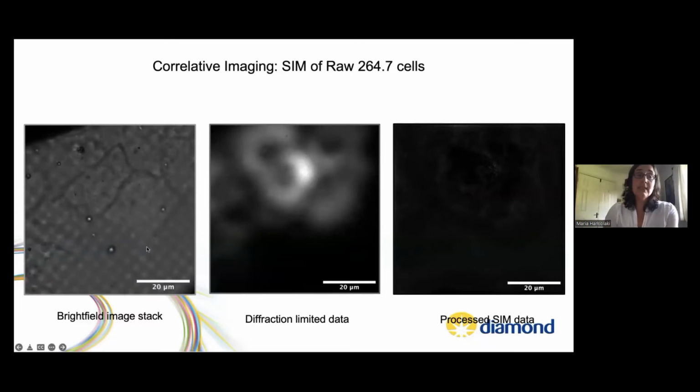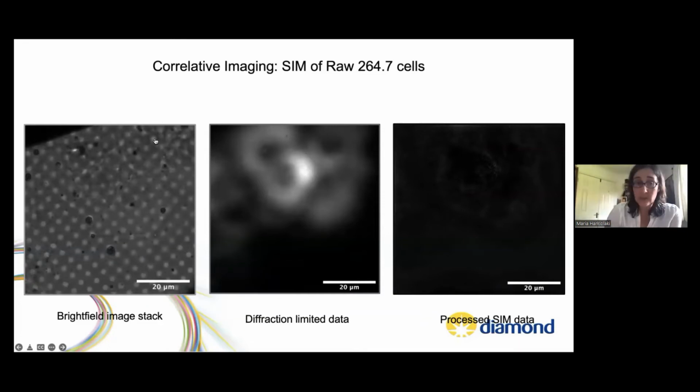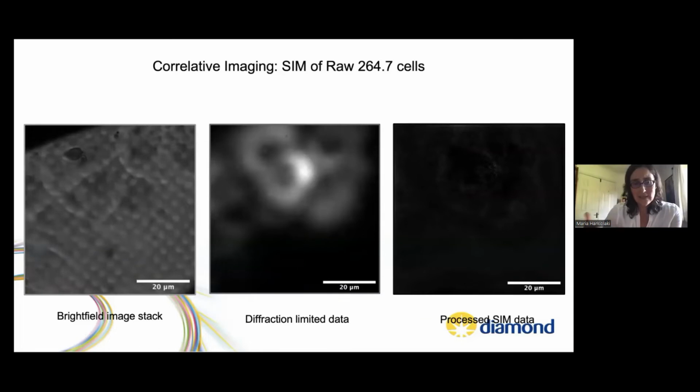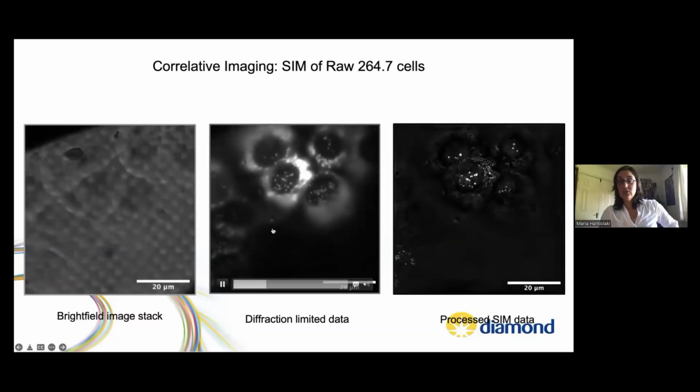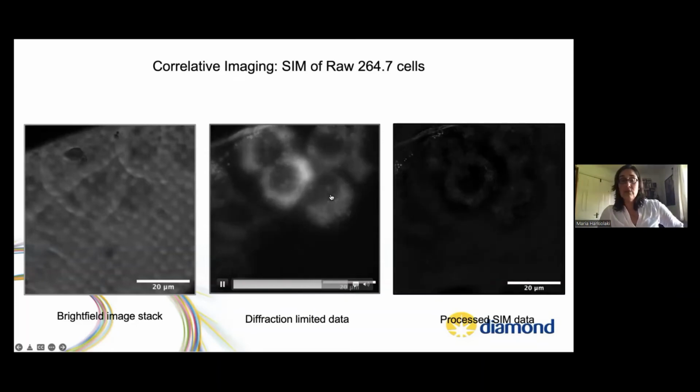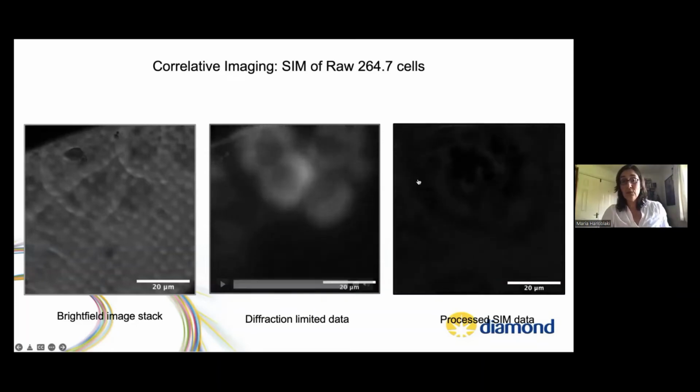As I said, bright field, several cells here. We're looking into mouse cells, macrophages. Again, this is an immunity-related project of ours. Not very impressive. They look like little jellies, but the same microscope can give you substantial information. And we label the mitochondria here. As I said, it was a training exercise, and you can see the difference from the diffraction-limited imaging here.